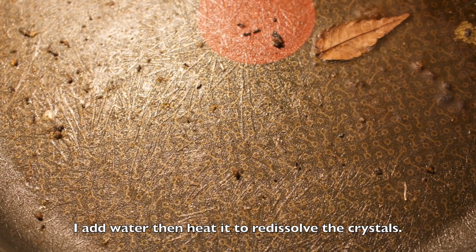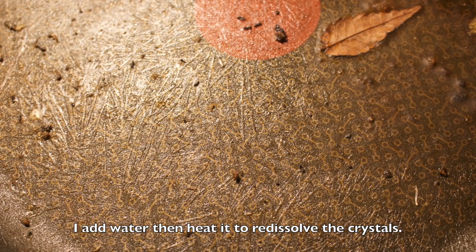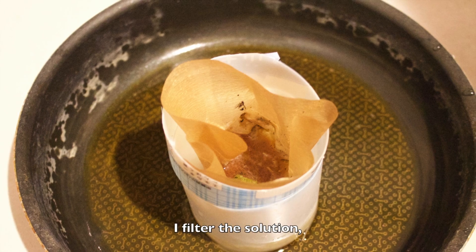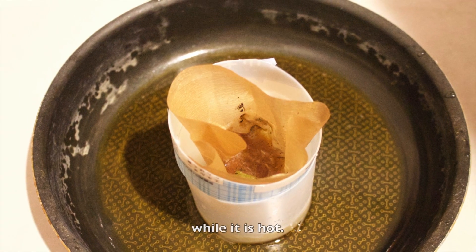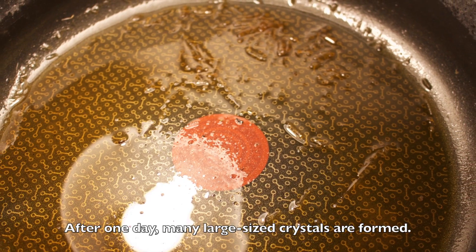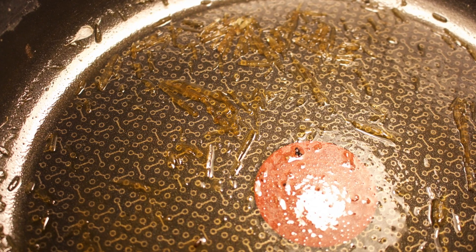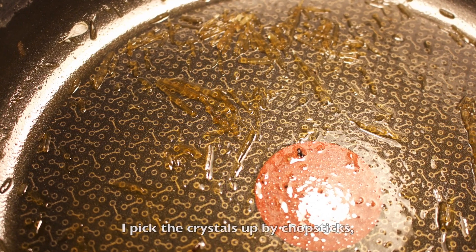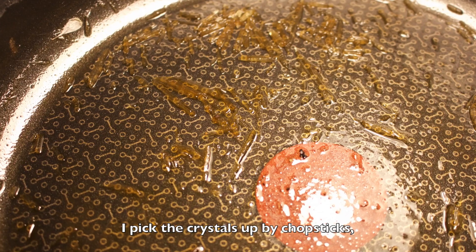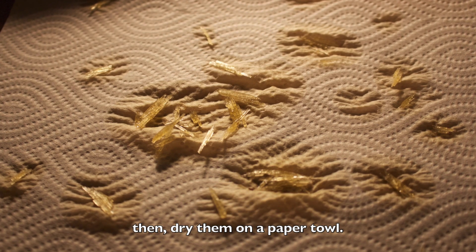I add water, then heat it to re-dissolve the crystals. I filter the solution while it is hot. After one day, many large-sized crystals are formed. I pick the crystals up by chalk sticks, then dry them on a paper towel.